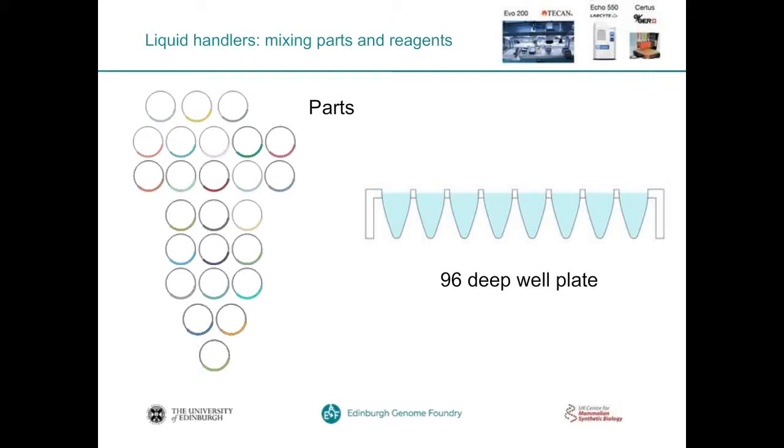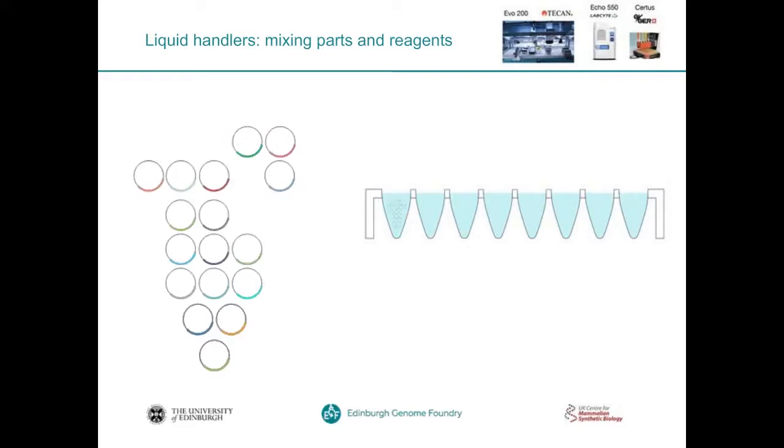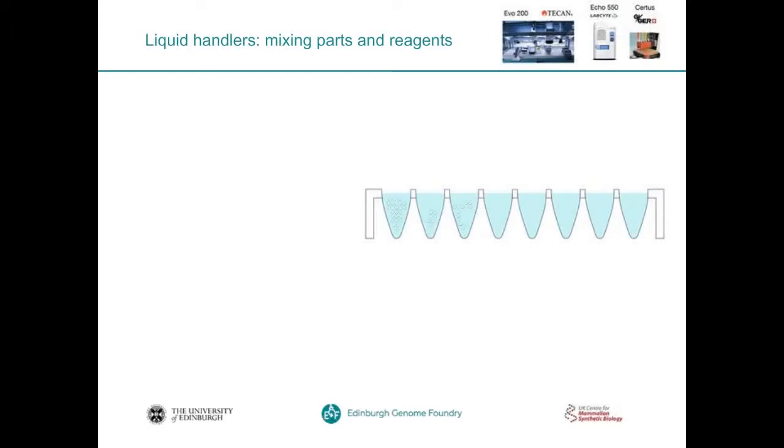So here in this segment, I'm going to tell you what instrumentation we actually need to do the workflow that I've just described. At the very beginning of the process is liquid handling. So here's where we actually select the DNA parts that our customers actually want, and we pick and mix them together into different tubes, as you'll see in the animations here. So these would represent 3 different assemblies, because we can add a portion of receiving vector to each of these so that they produce 3 different assemblies in the same plate.